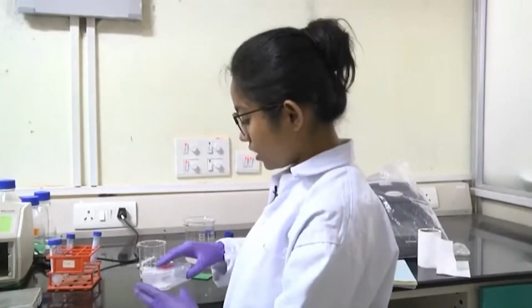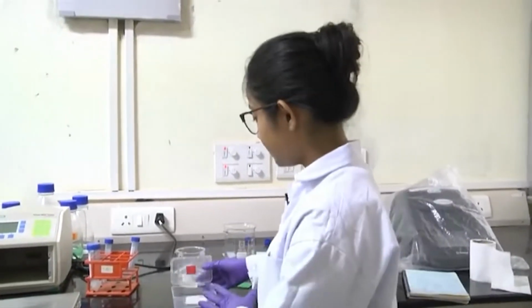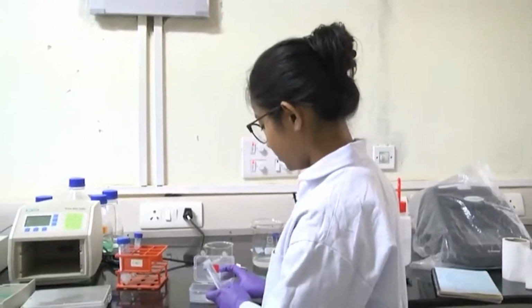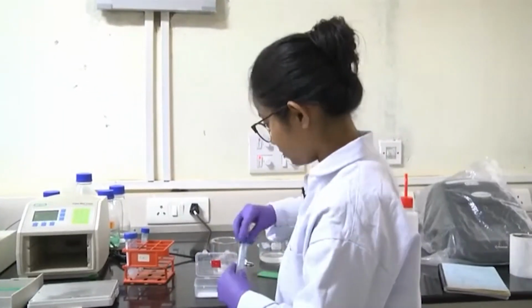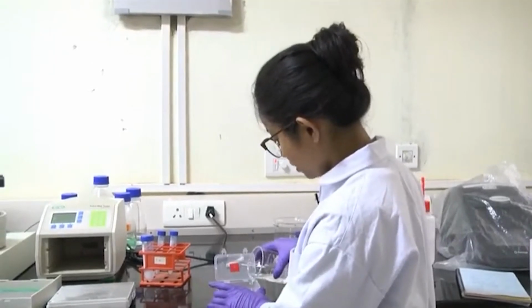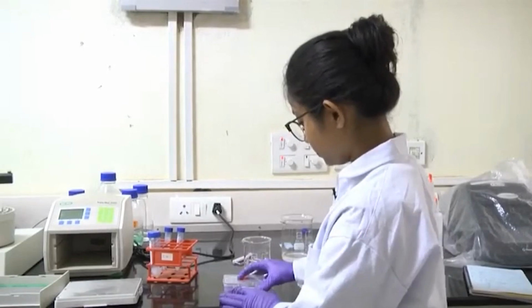Now, the membrane has been almost 1 hour in the secondary antibody. So now we will remove the secondary antibody. And we will wash the membrane again 3 times with the TBST buffer.